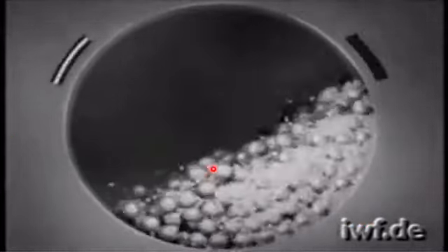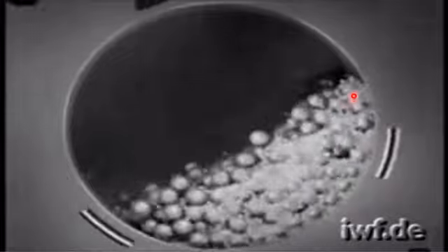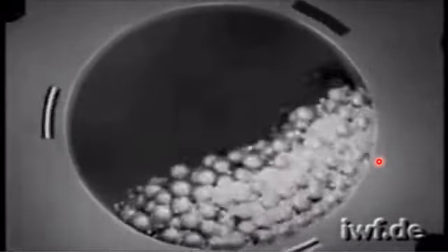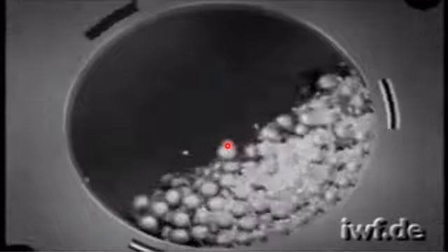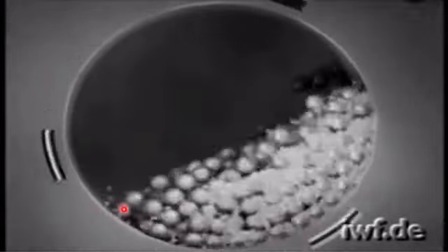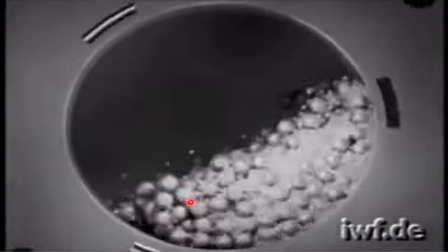So in order to avoid the impurity, the internal part of the ball mill is lined or covered with abrasion-resistant material.